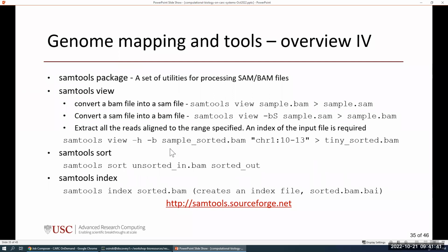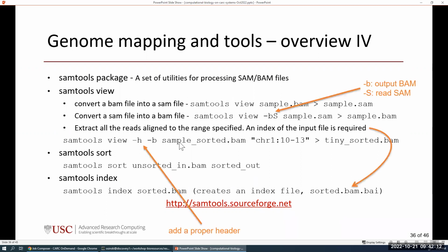We can extract particular elements, like certain fragments, to a different part. Why? Because genome files are huge. Processing huge files requires lots of resources, and of course, it requires a lot of time. So if you run things once, then it doesn't matter. If you run things several times, then time savings are sort of critical.